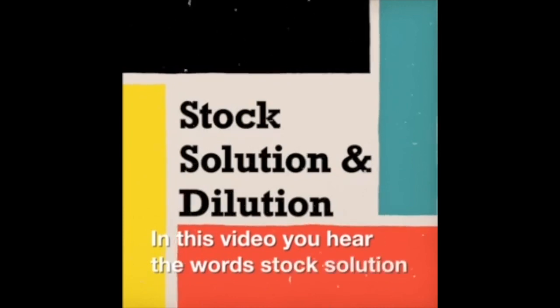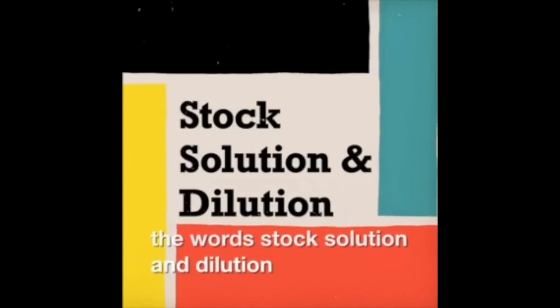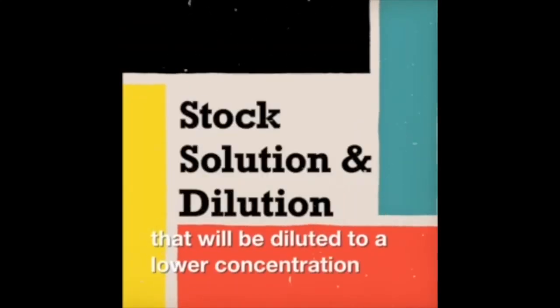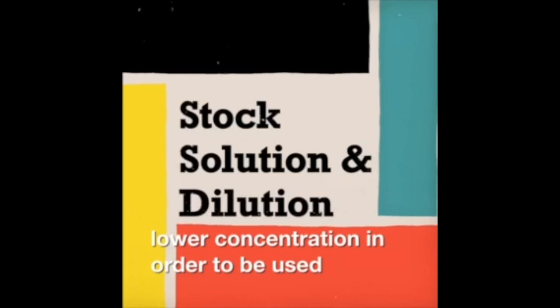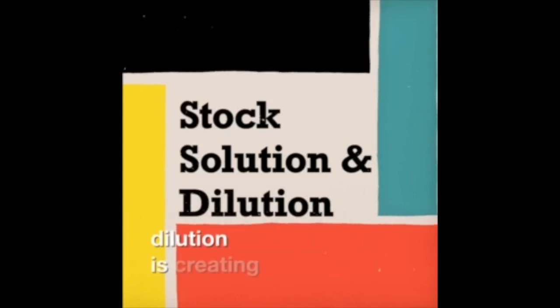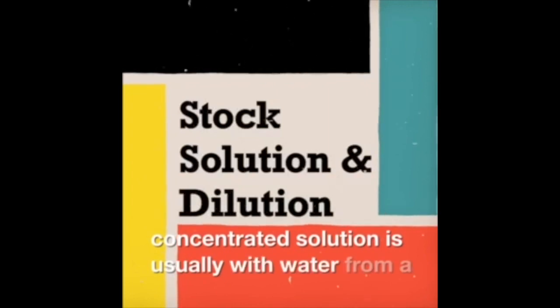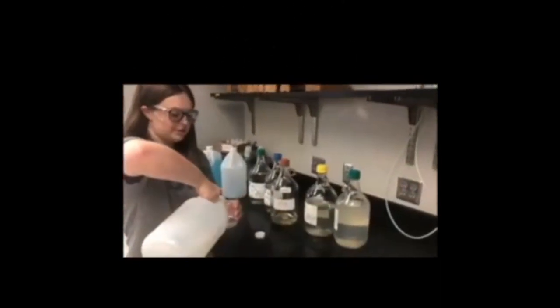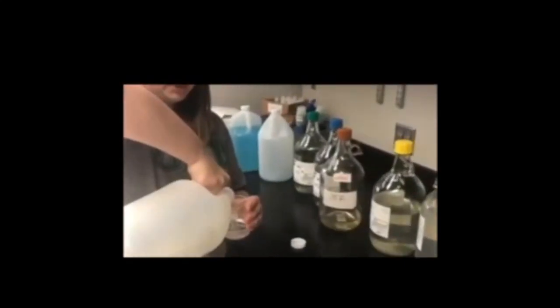In this video, you will hear the words stock solution and dilution. Stock solution is a concentrated solution that will be diluted to a lower concentration in order to be used. Dilution is creating less concentrated solutions, usually with water, from a stock solution. A stock solution is the more concentrated solution that is used in a dilution experiment.